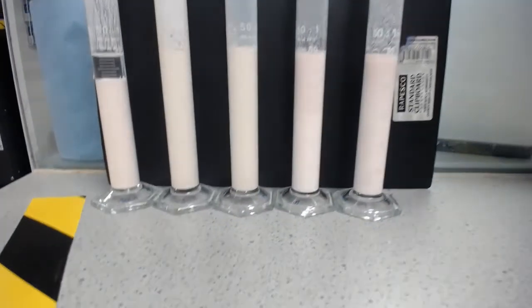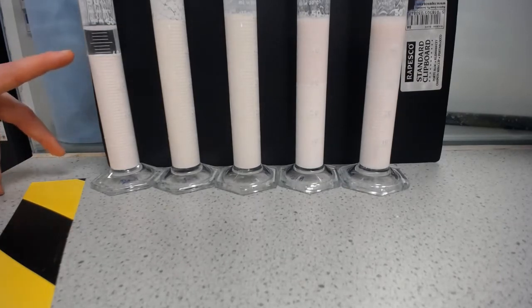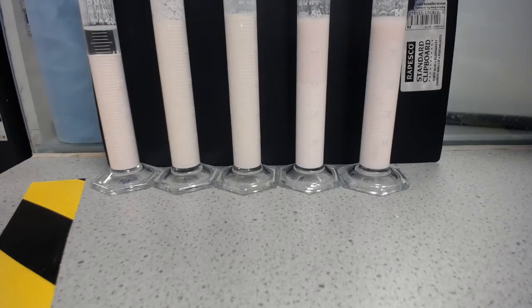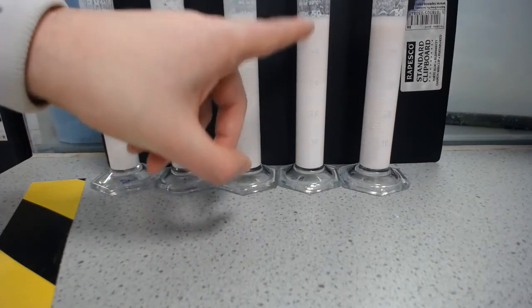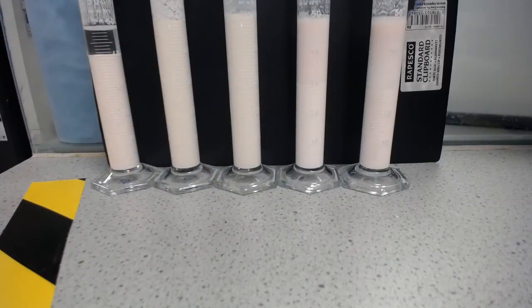So we'll go into more depth on this, but I think what's pretty obvious is that the two formulations with bentonite have actually been far more stable over the hour, and the one without anything else in there, no clay, no trisodium citrate, bentonite being a clay, has a very, very clean split, and the ones with trisodium citrate, that maybe is stabilising it in another way, have a think about that, we've still got splitting, and it's splitting a lot further down than it is with just water and glycerin in there.